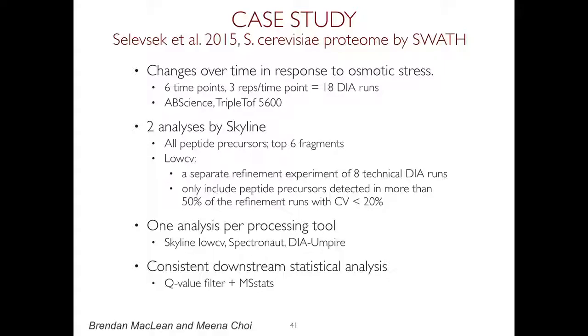So we cannot replace entirely the work that is happening at the data generation and data processing step. So this is an experiment from Natalie Selevsek from the Aebersold lab, which was profiling the yeast proteome by SWATH. And it's actually the same biological experiment as this 10 time point study I was showing earlier. So this is a response to osmotic stress, except that the original study was using SRM, and this study is using SWATH or DIA.